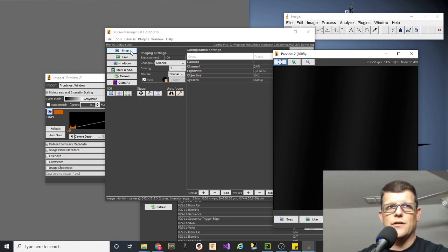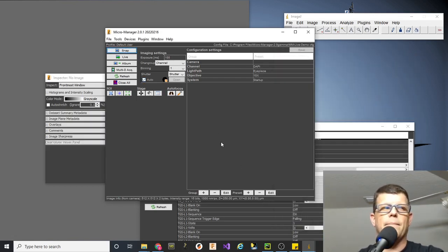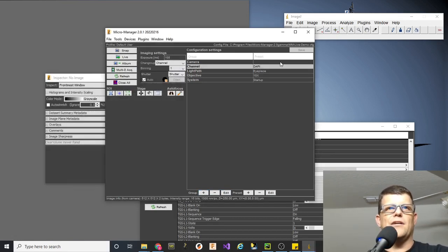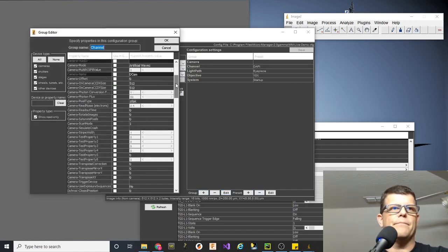So the next question is, how do I assign multiple channels to be controlled via the use of the TTL and analog outputs on lasers 1 through 4? What I'll do is go to a group. This is the group button down here that adds a group to our list. And this group that I'm going to use, we already have a channel group. Probably I should just edit this guy. Let's see. We'll edit him.